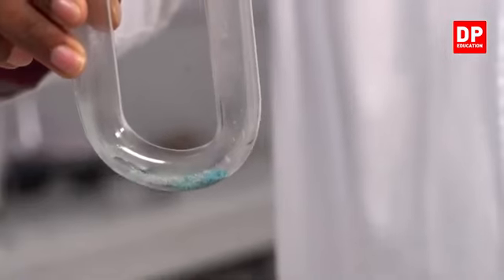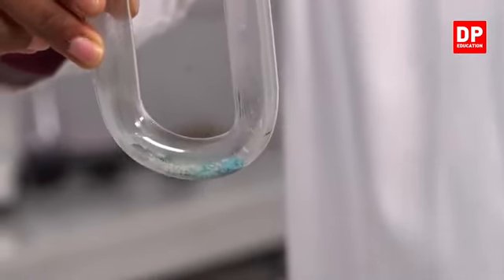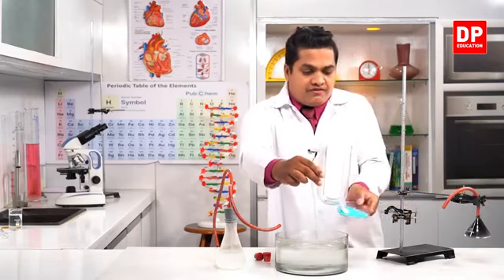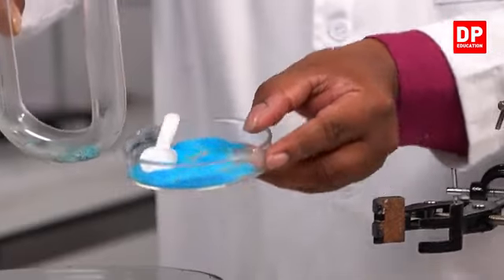We can observe it. It has converted into a blue color. You can see it very clearly. Means like this copper sulfate, I'll take the actual copper sulfate. So like this, it's been converted into blue color.